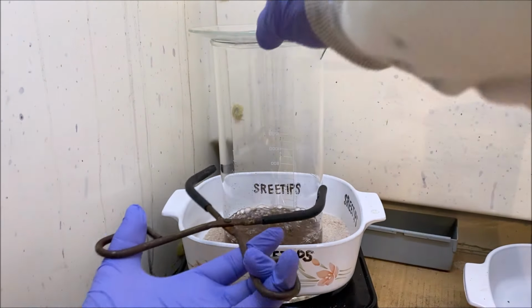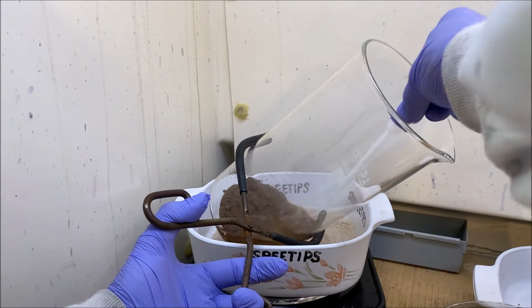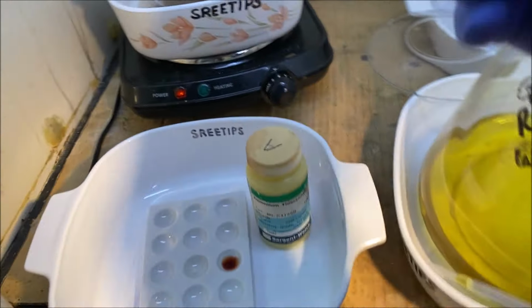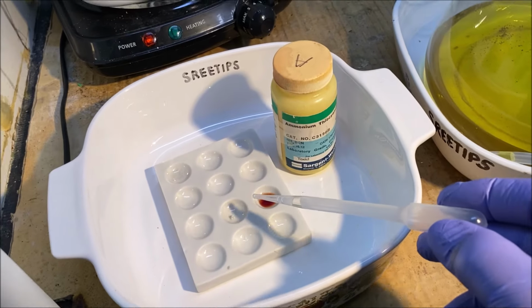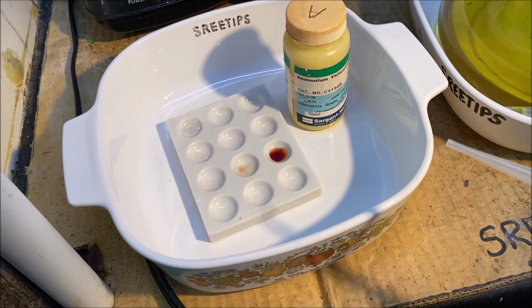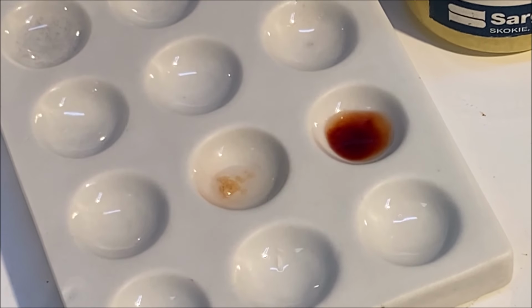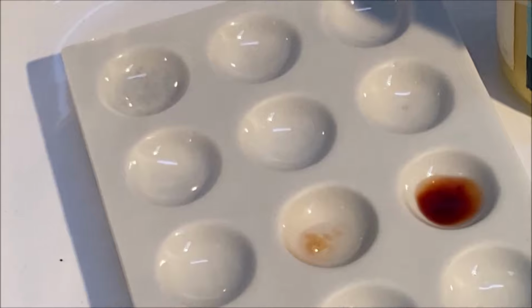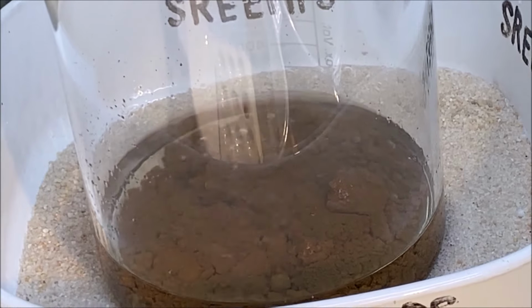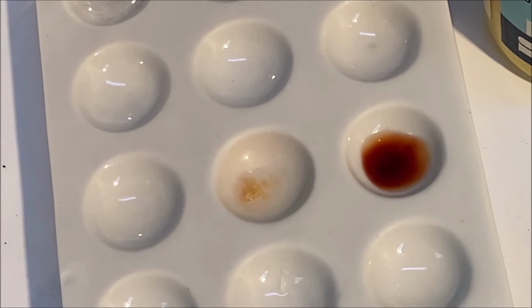This is a fairly sensitive test. I'll reach down in here. Some of this hydrochloric is boiling, and we're going to take that on this other little cavity of ammonium thiocyanate and see if we get a reaction. You can see there that I've got just a little bit of a pink color going on. So that means that I've still got iron in that liquid, in with that gold. So I got to continue to rinse until I don't have any more reaction with the ammonium thiocyanate.